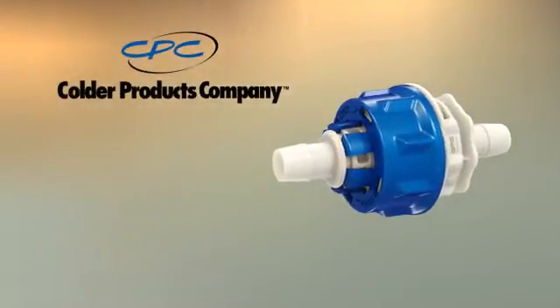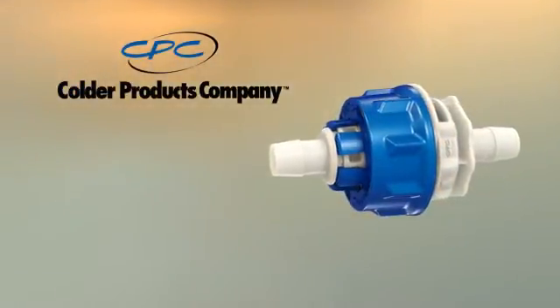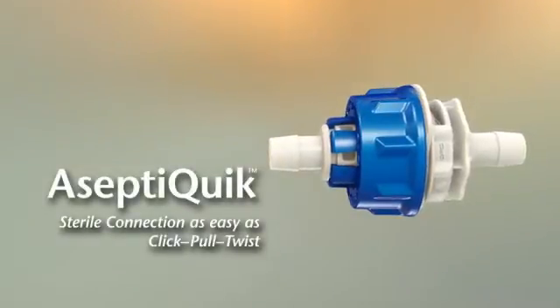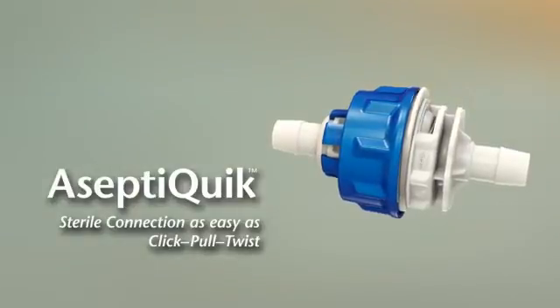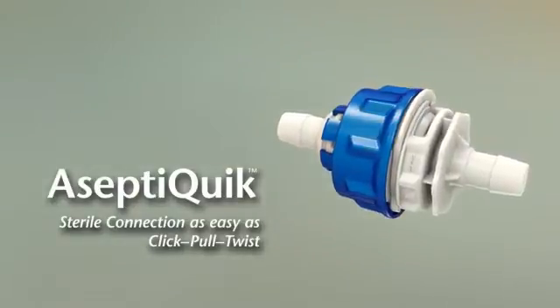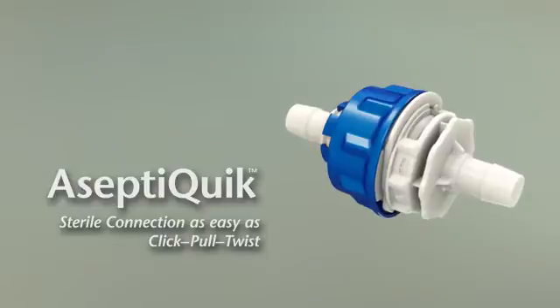Kolder Products Company advances sterile fluid transfer with the introduction of the AseptiQuick sterile connector. The intuitive click-pull-twist design provides the ease of use and reliability expected from the leader in single-use connection technology.